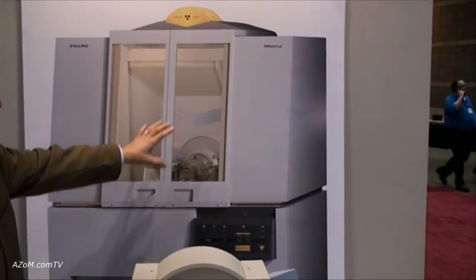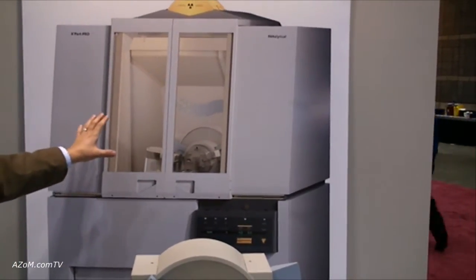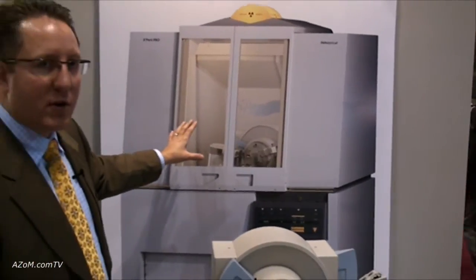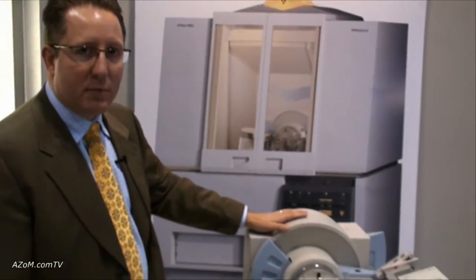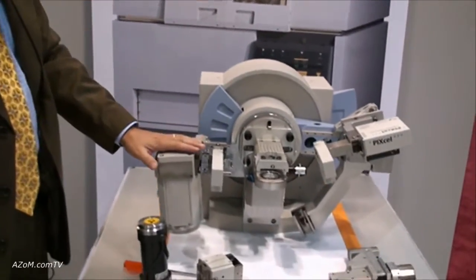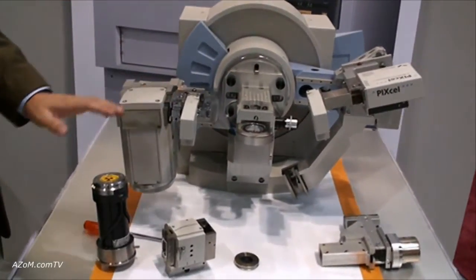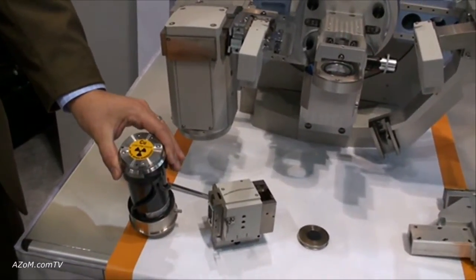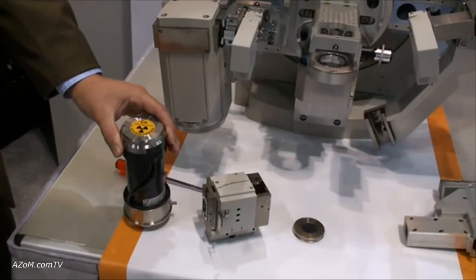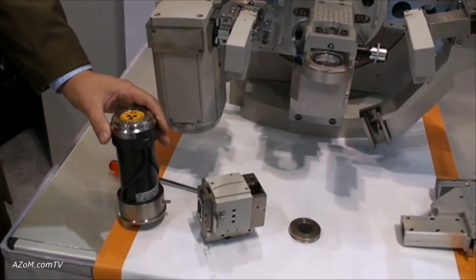The main components of the system include a radiation safe enclosure. Inside the instrument is a goniometer that drives an optical path consisting of proprietary X-ray tube technology, top-referenced radiation sources including copper, chromium, cobalt, all the way up into silver radiation as a hard radiation for PDF analysis.